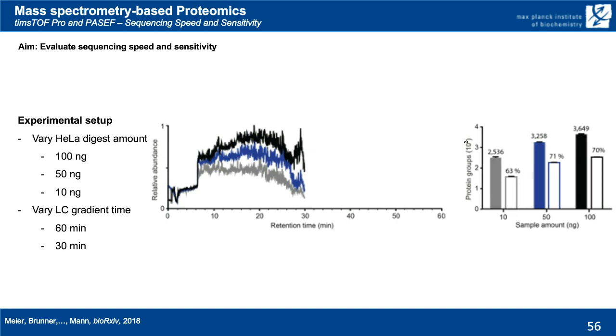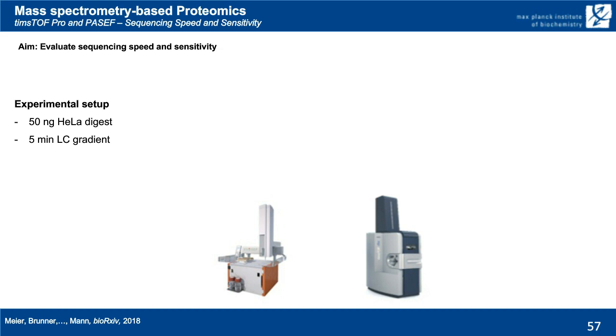And then, for some time we have had this new LC in our laboratory, which is called the EvoSep One, and the strength of this LC system is very small gradient times, and also the carryover is super low, and the LC downtime is minimized.